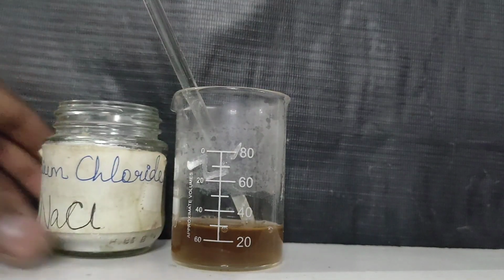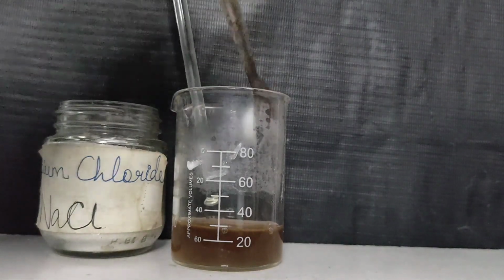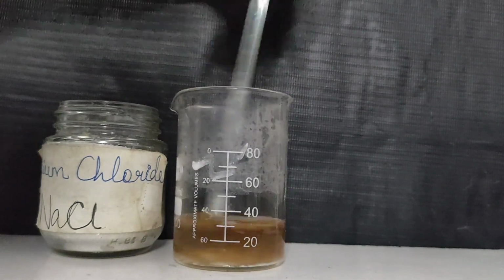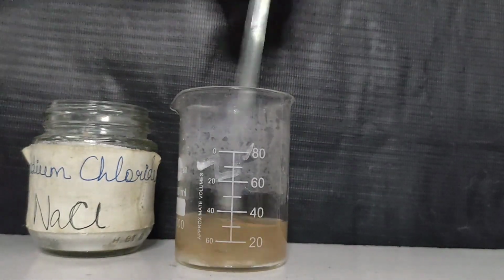Now to this solution, to separate the sodium salt of naphthalene 1-sulphonic acid, I will be adding sodium chloride. This will separate the sodium salt of naphthalene 1-sulphonic acid by common ion effect.